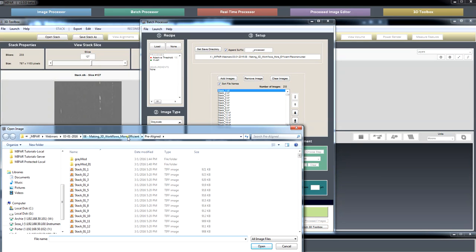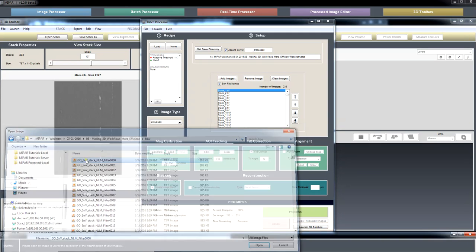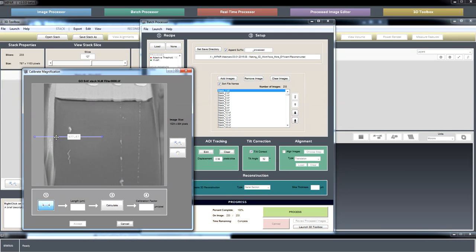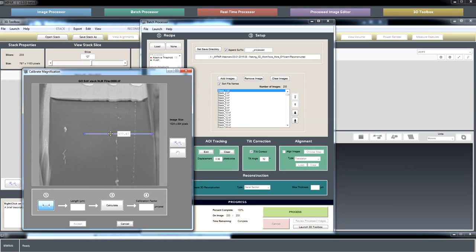I believe Josh had told me that, we go back to the raw image here, that the width across here, that's actually the edge of the image right there. I'm trying to work on that.